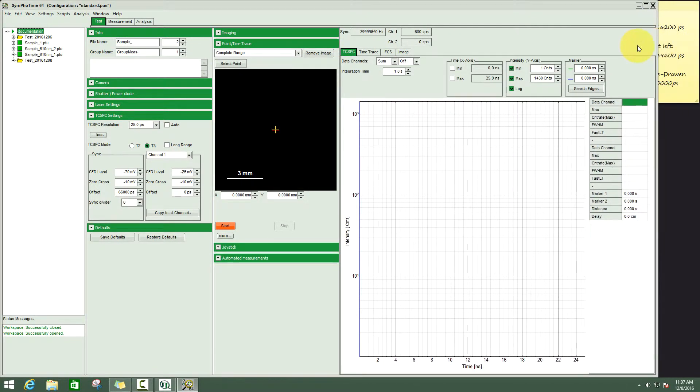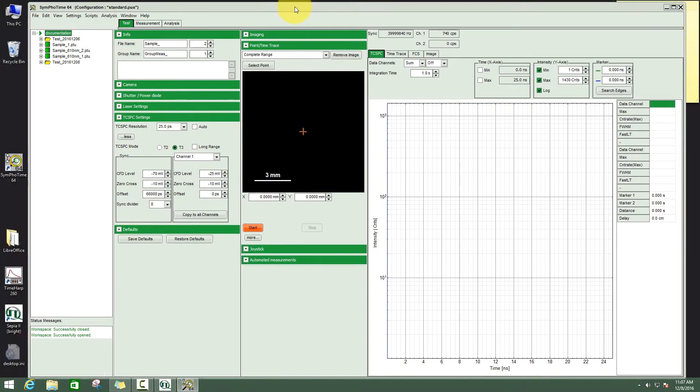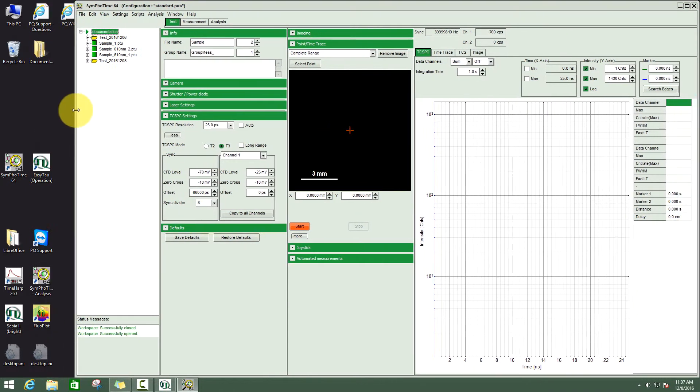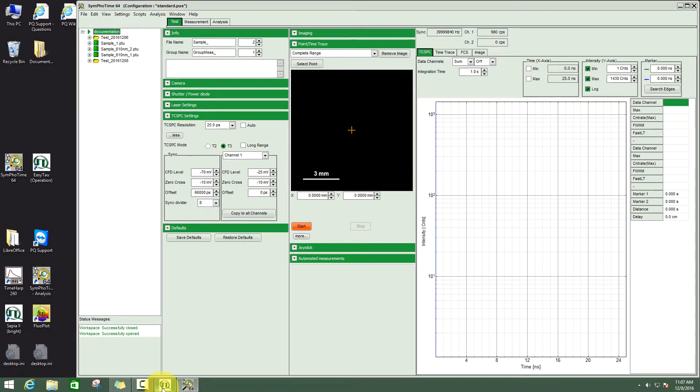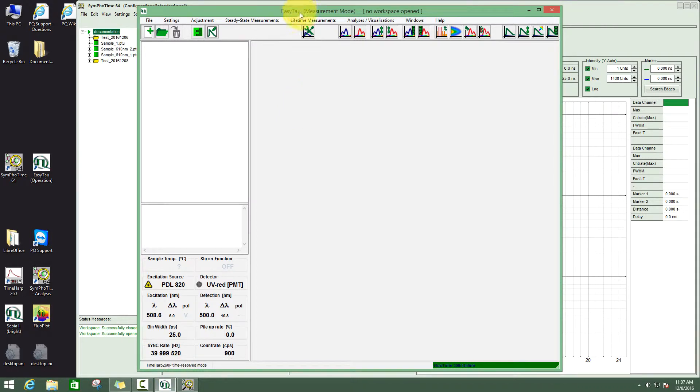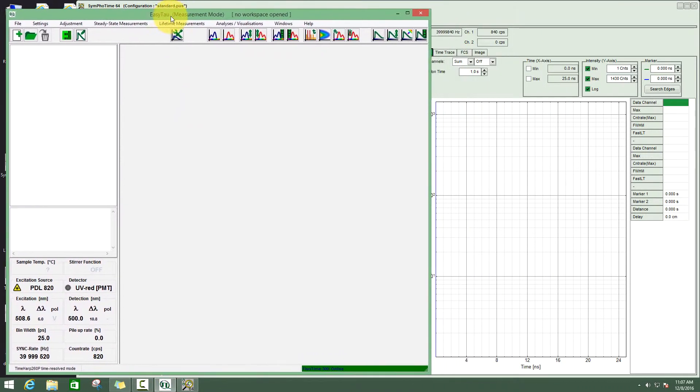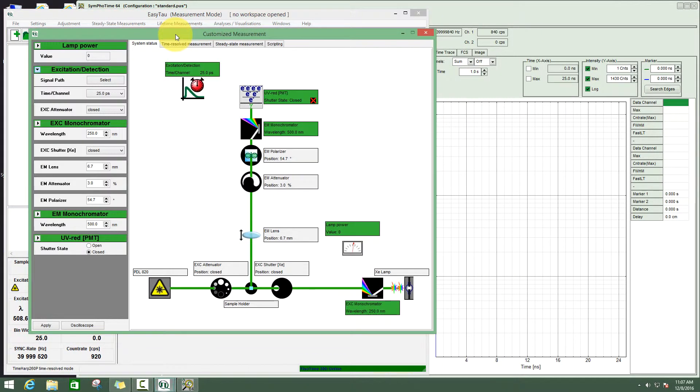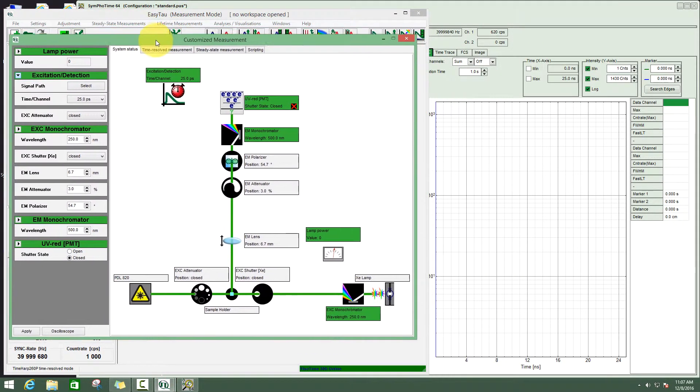I'll make these windows a little bit smaller so that we can work with both softwares in parallel. In the EasyTau software, we will need mainly the customized mode.